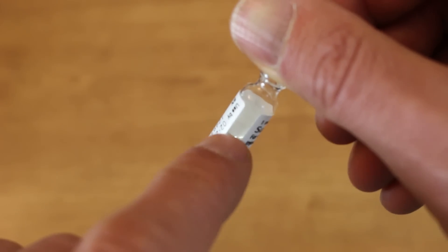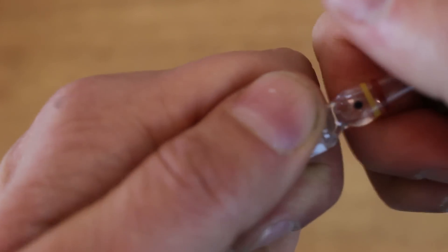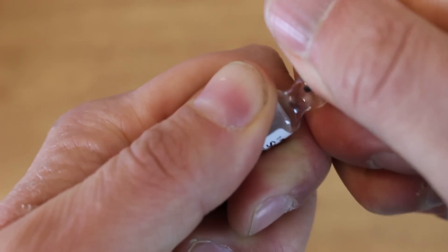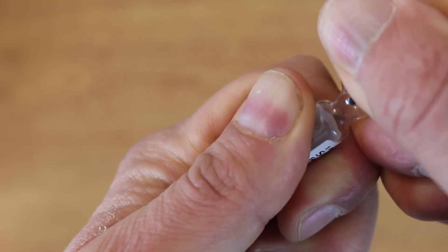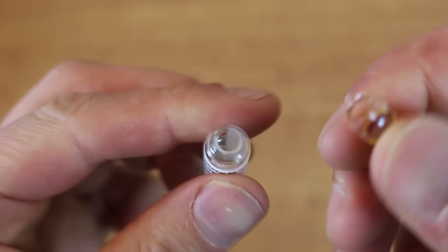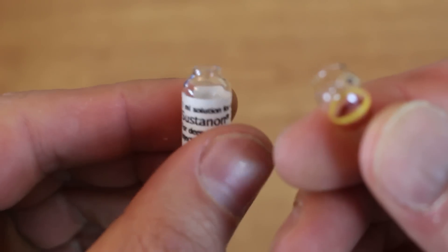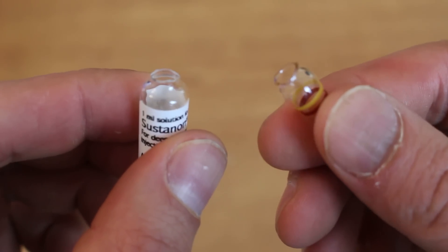And finally, I'm going to hold the ampoule in my hands with my fingers in the position I showed you, and I'm going to gently apply pressure in the direction we've learned until it makes a pop. And there you go — the ampoule is open and you don't have glass in your fingers.